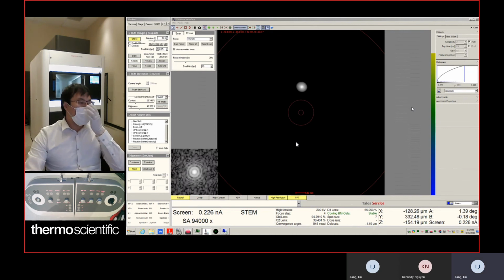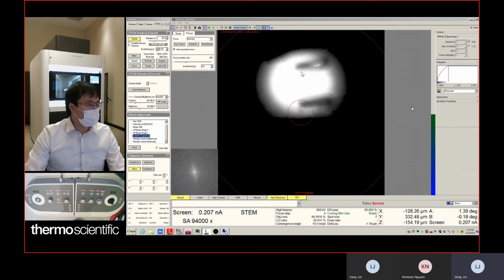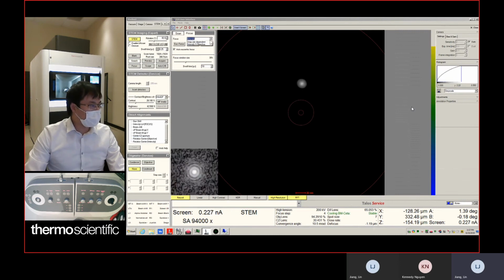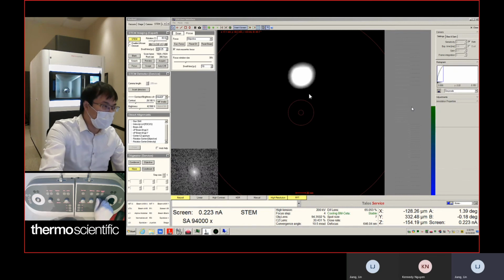Okay. One thing I forgot to mention is that we need to set up, when we choose the focus as intensity, so when we wobble the C2, you see the C2 wobble concentrically. But when we choose the focus as objective and you center C2, the intensity is not going to work. So you use focus to go over focus and under focus, right?